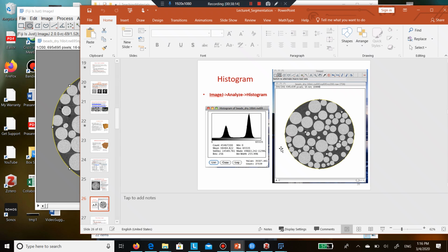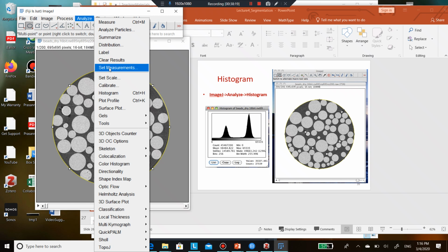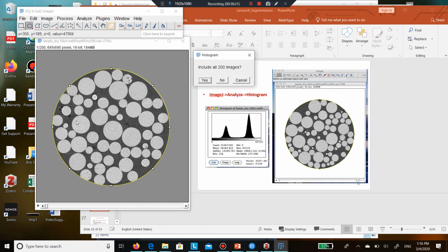Okay, excellent. So now, regardless, for the purpose of this, if you do a histogram, it's going to take only the image. However, if I export this as an image and send it to my favorite other software, that software will regard this as an image, with values of 35,000 or whatever this said.